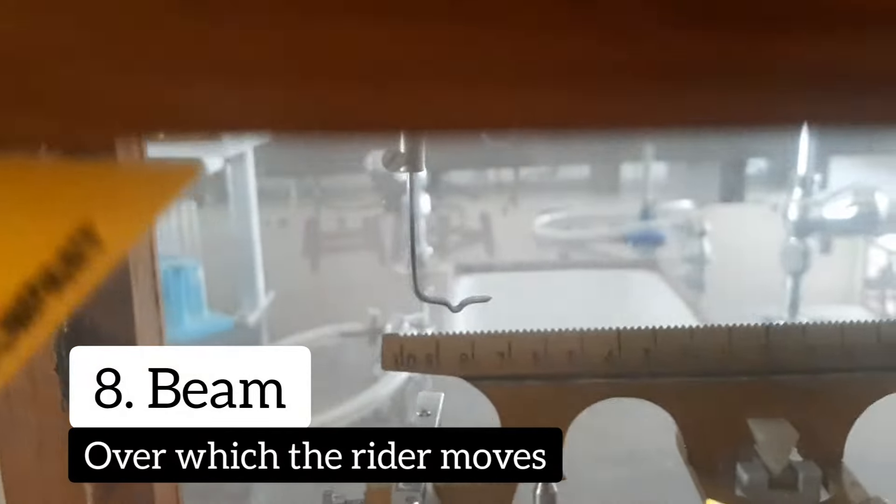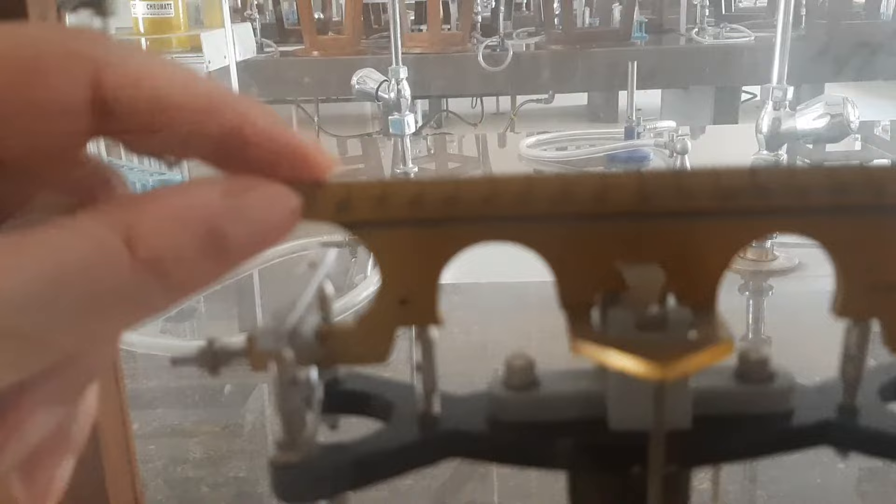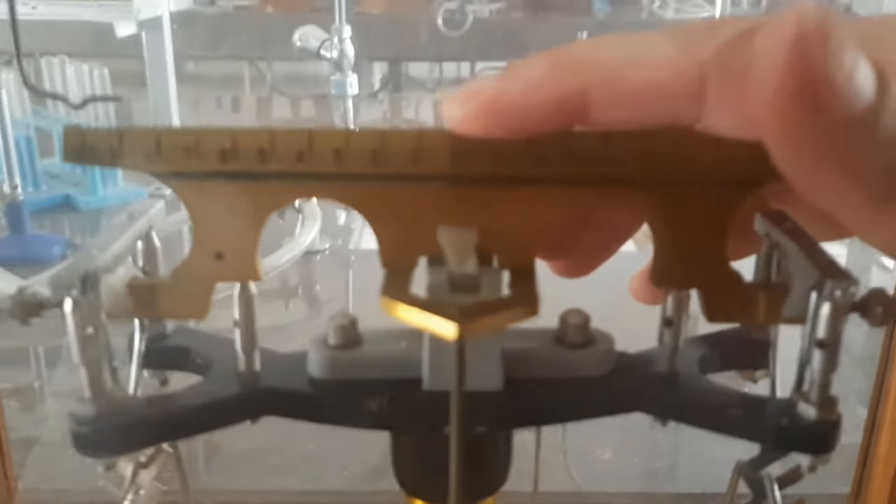This part is the beam, and this is where we are going to pick up and place a rider. This is the rider scale on which we place a rider to make minor adjustments in mass. In the center we have zero, and it goes from zero to ten on this side and similarly zero to ten on the other side.